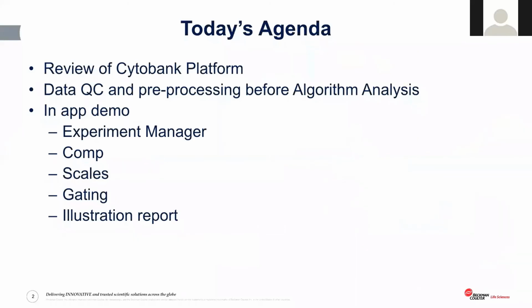Then I will go through a few slides on data QC and data pre-processing that's needed for algorithm analysis. I will offer a few tips on the importance of generating high-quality data, especially for machine learning algorithm, which sometimes can be missed.